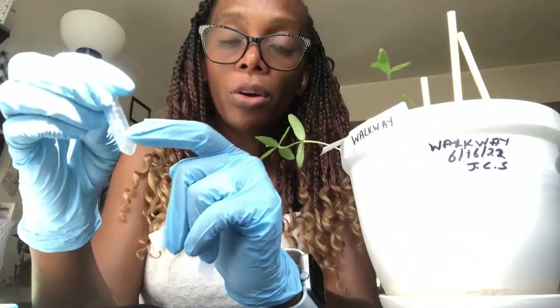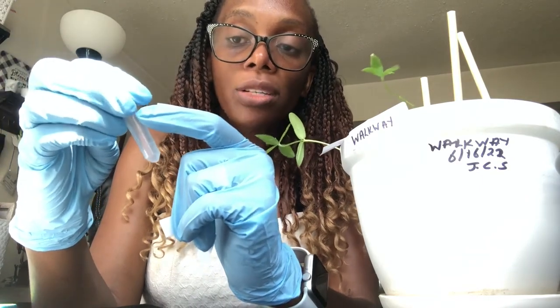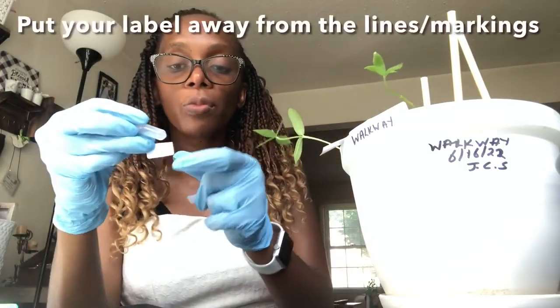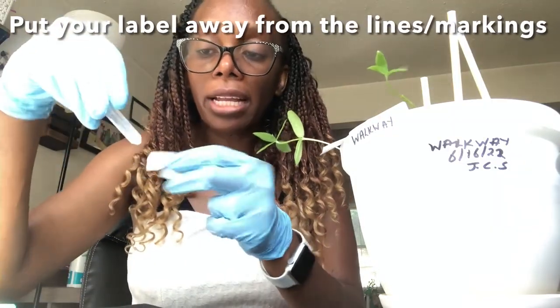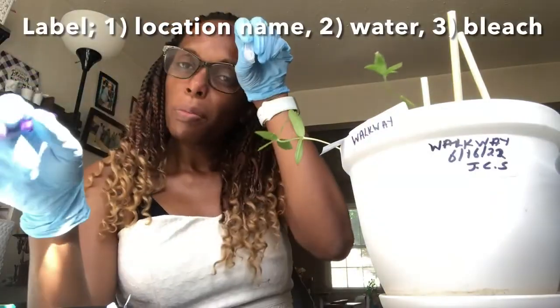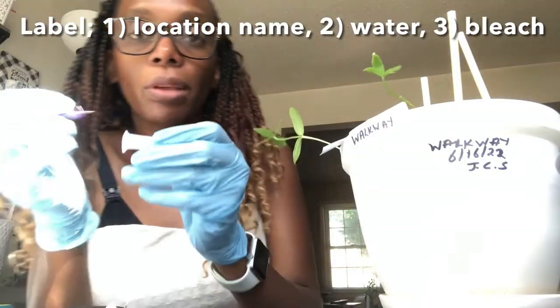So is it going to be below the 0.5 mark? It's going to be on the 1.0 mark, or the 2.0 mark, or 1.5. So remember that. Even when you put your label, put it away from the markings so that you can actually see. And what do you put on the label? On the first label, please put the location that you're doing. So for me, it's going to be walkway.